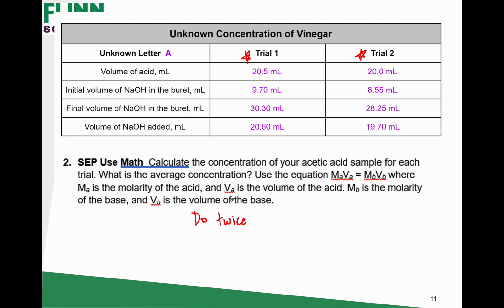Then after you do that, don't forget, ladies, to determine what is the average concentration. Okay, taking your final answer from trial 1, taking your final answer from trial 2, and using that to figure out what is the average of those two.